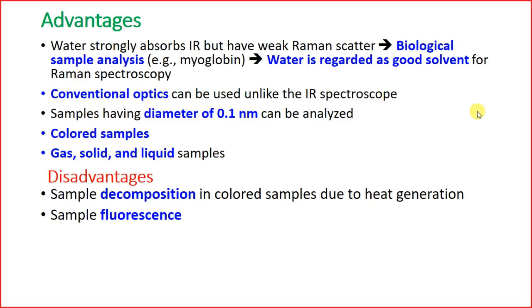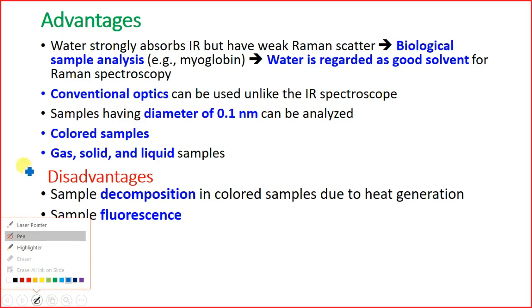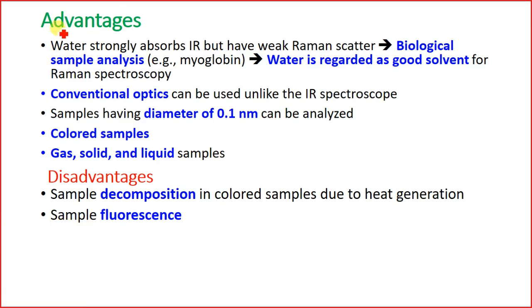Now, what are the advantages of Raman spectroscopy? Water molecules strongly absorb IR, but they have a weak Raman scatter.